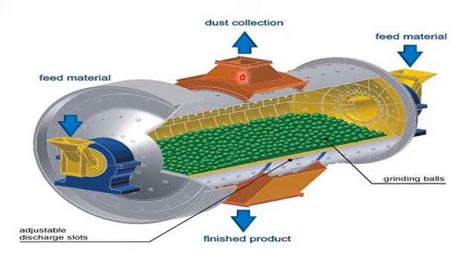Okay. Please note that, as I previously discussed, usually in milling apparatus the ratio of the ball to the powder or bulk material is between 10 to 1 or 20 to 1. However, in general, at small laboratory scale in grinding ball milling apparatuses, the ratio of ball to powder is around 2 to 1.